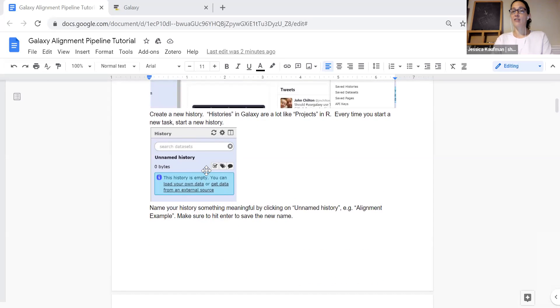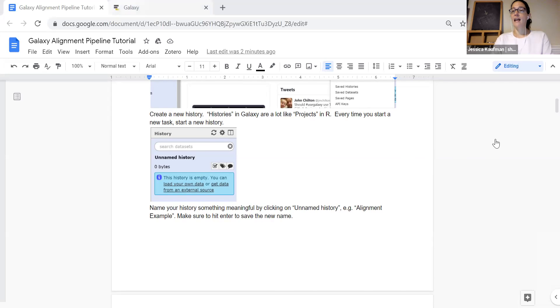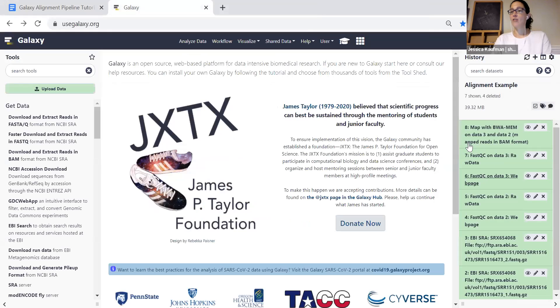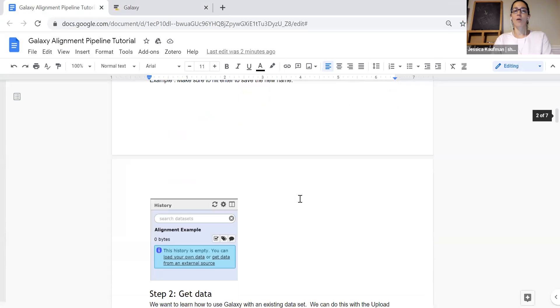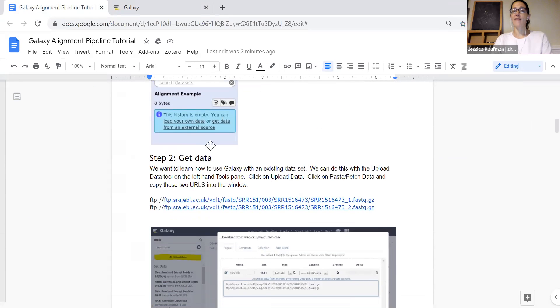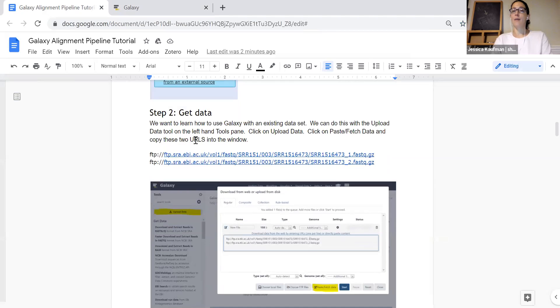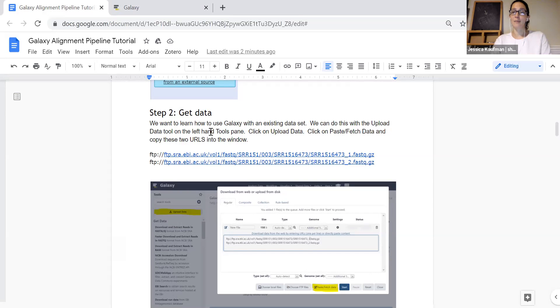So the first thing that you're going to do is go to usegalaxy.org and log in. Once you log in you'll start a new history. I've named my history alignment example and I have it already run here just so I can show you each of the steps. Once you have that history set up it will be empty and we have to fill it with the data that we're going to use for this experiment.